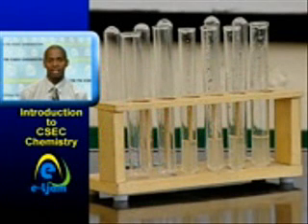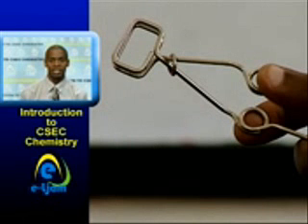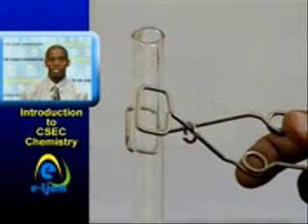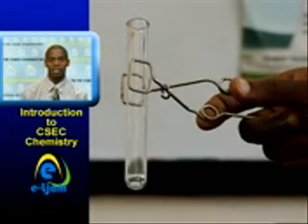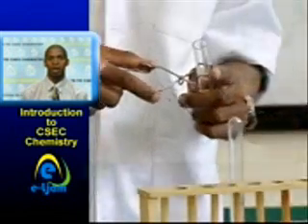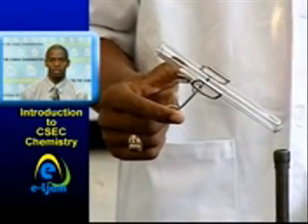Test tube holders are racks that are designed to hold test tubes within a laboratory environment. Test tube holders come in a range of sizes, including racks that hold multiple test tubes, as well as a single test tube holder, which allows the person to hold one test tube at a time using a metal clip at the end of a handle. This is used to grip or hold the test tube firmly about halfway up its length, especially during heating or when reacting 2 chemicals to prevent contact with the hands.